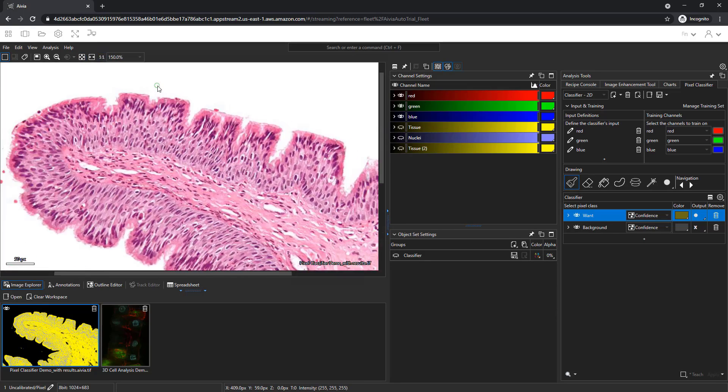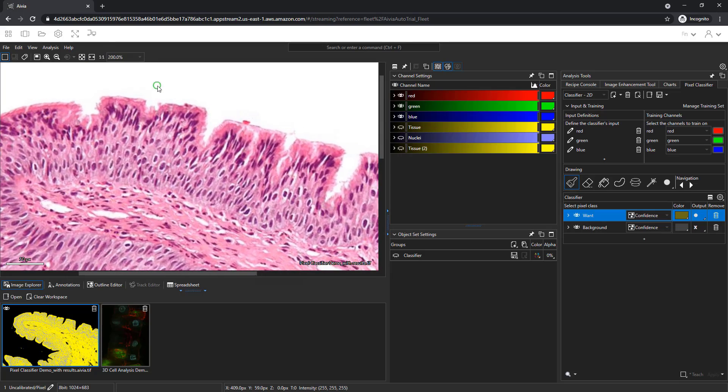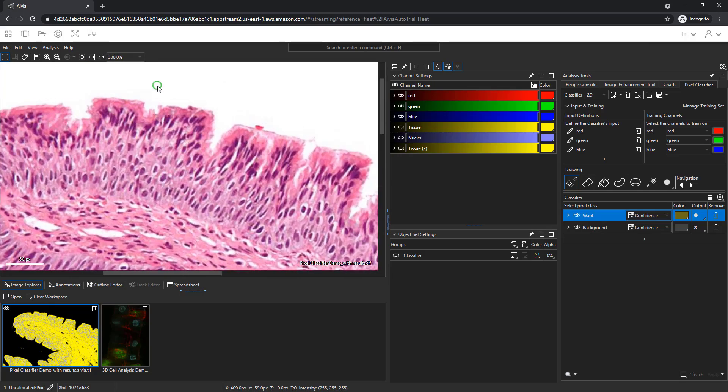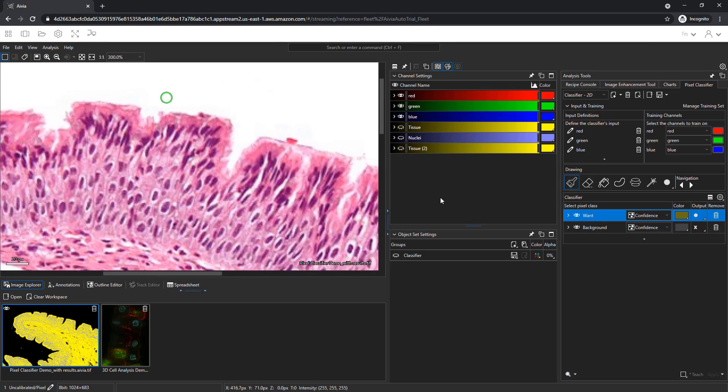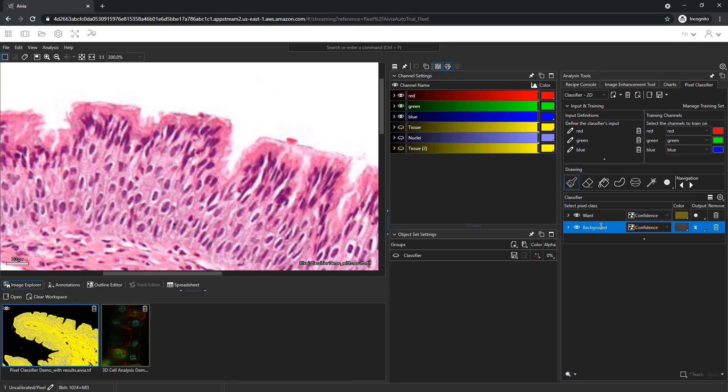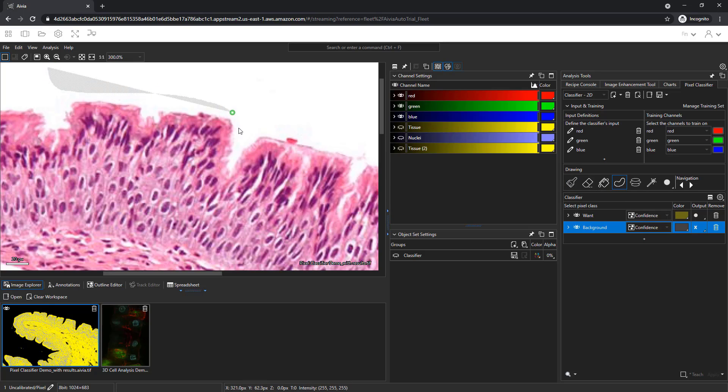Let's zoom in on the image. Use the scroll wheel to zoom in. Select the class to define by clicking on its row. We will start with the background. Select the region tool and drag your mouse over the white background area.